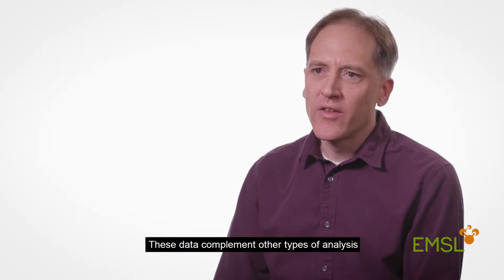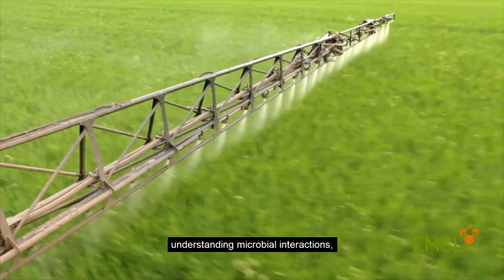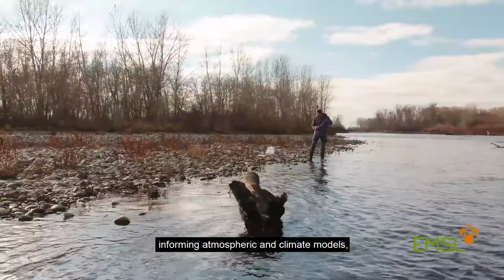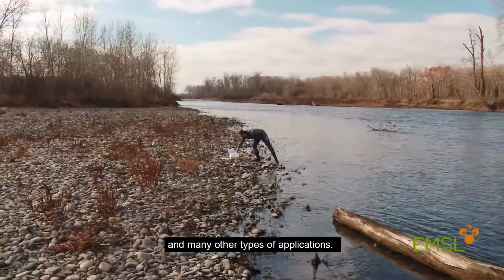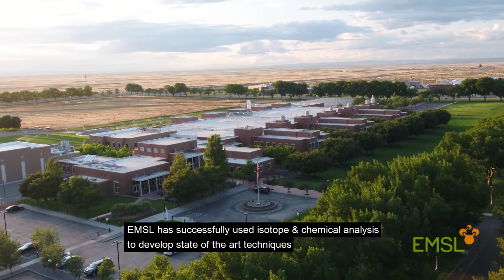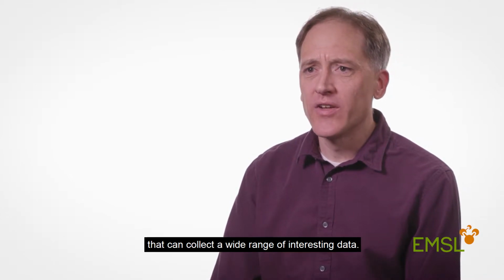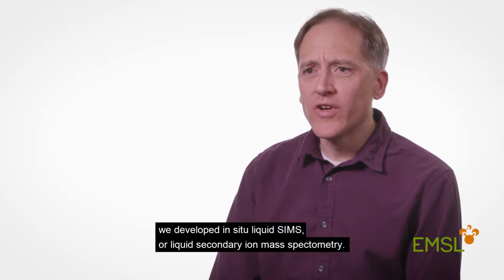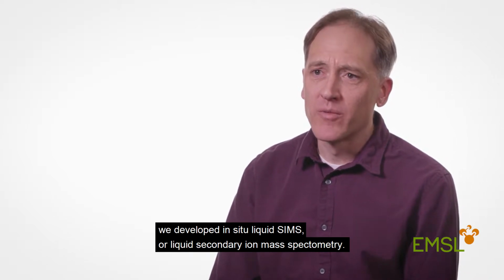These data complement other types of analysis to provide insights for tracing soil carbon, understanding microbial interactions, informing atmospheric and climate models, and many other types of applications. EMSL has successfully used isotope and chemical analysis to develop state-of-the-art techniques that can collect a wide range of interesting data. For example, we developed in situ liquid SIMS, or liquid secondary ion mass spectrometry.